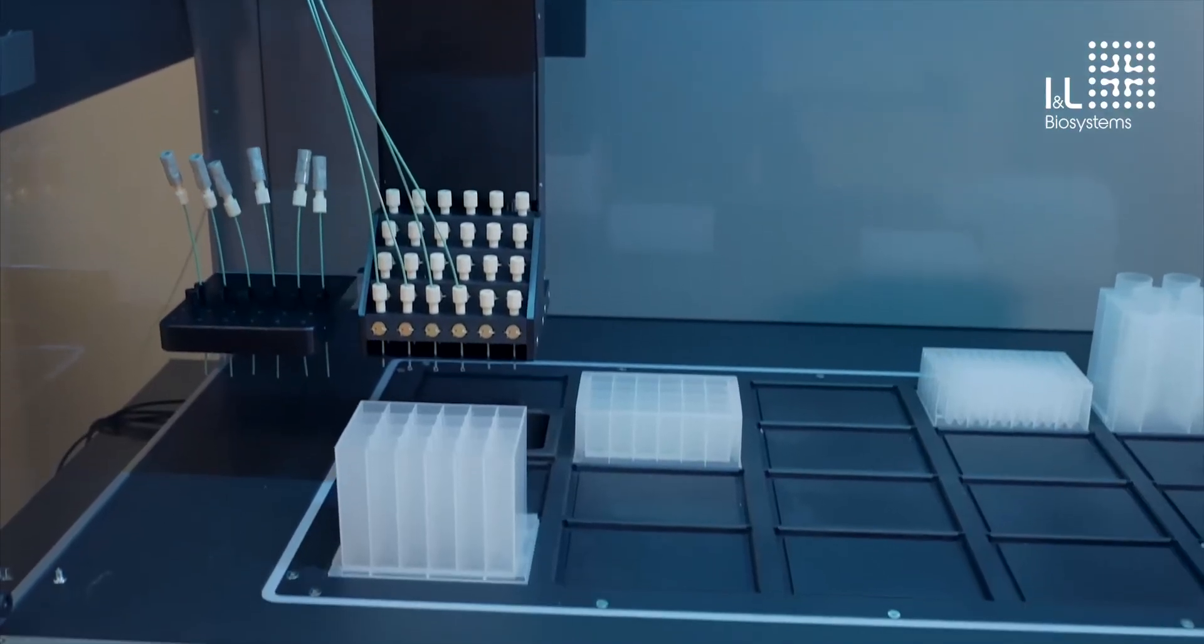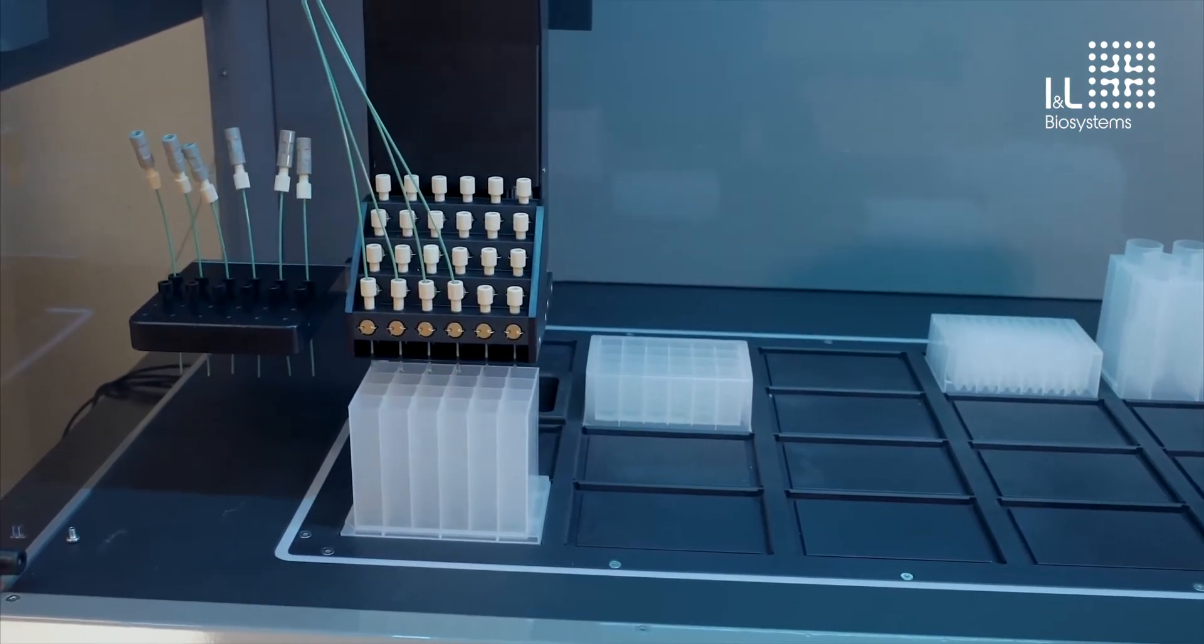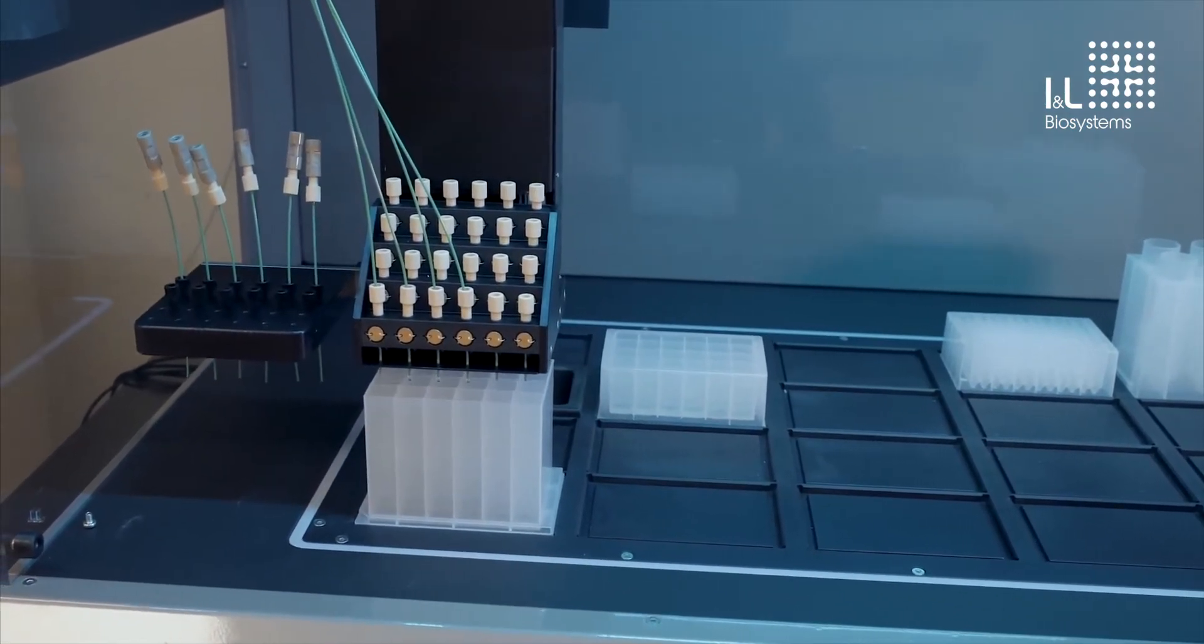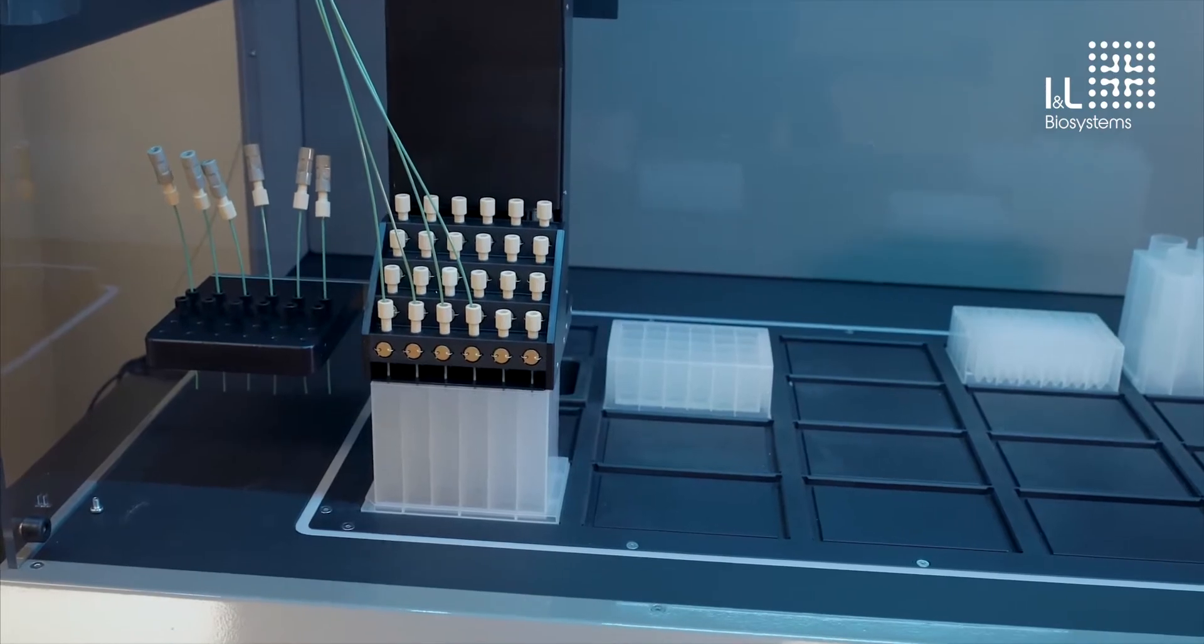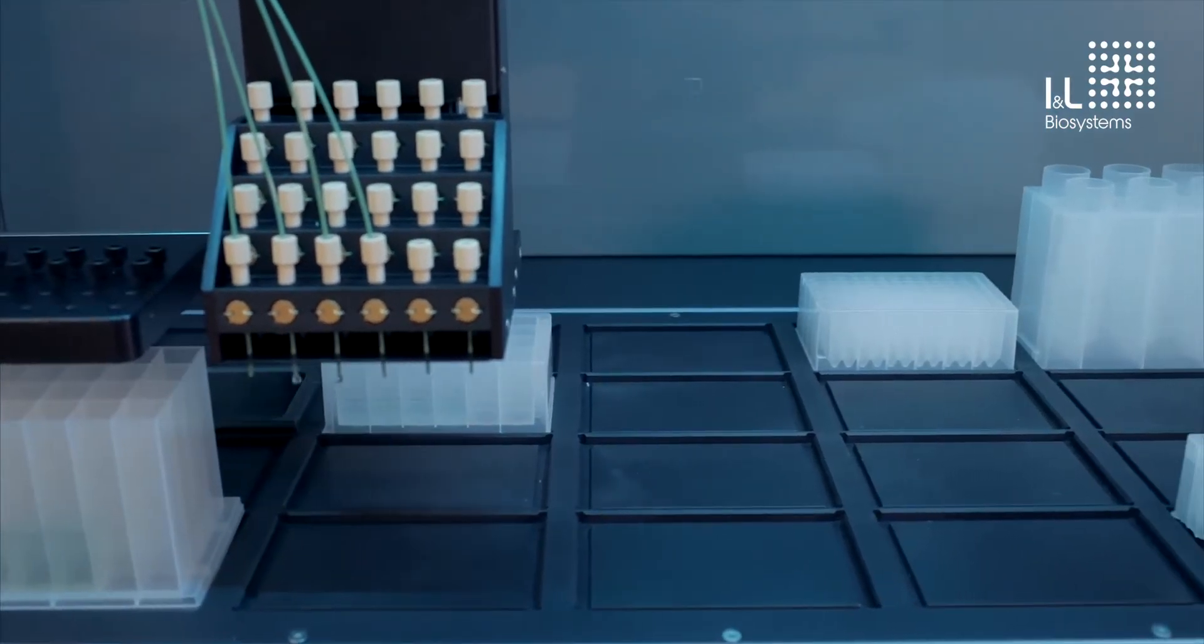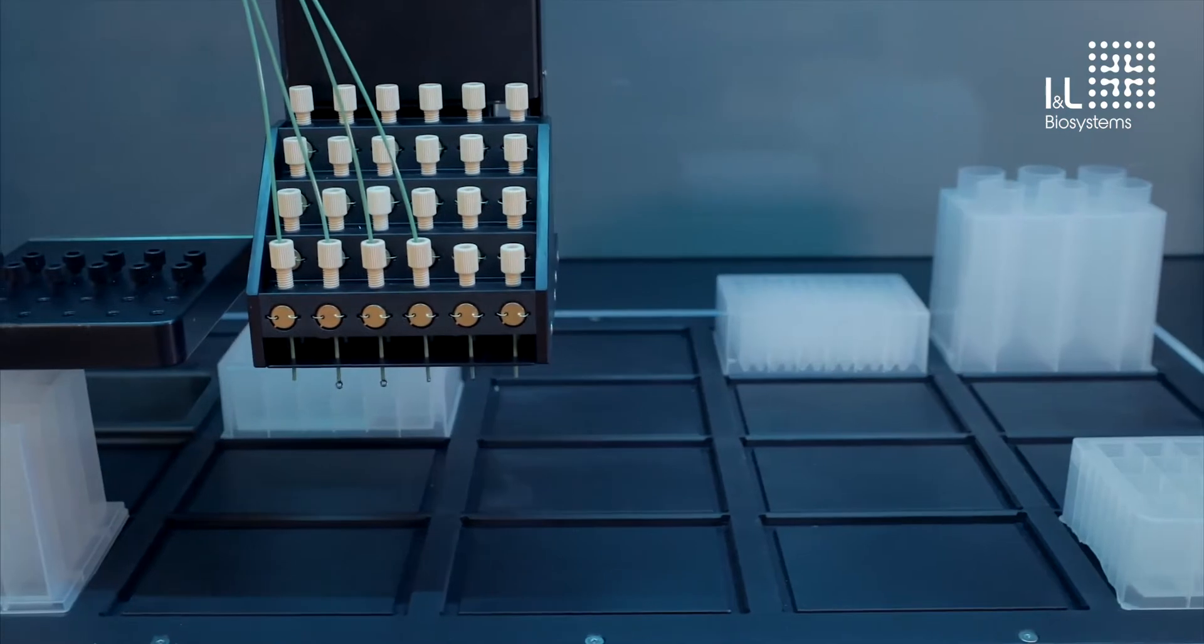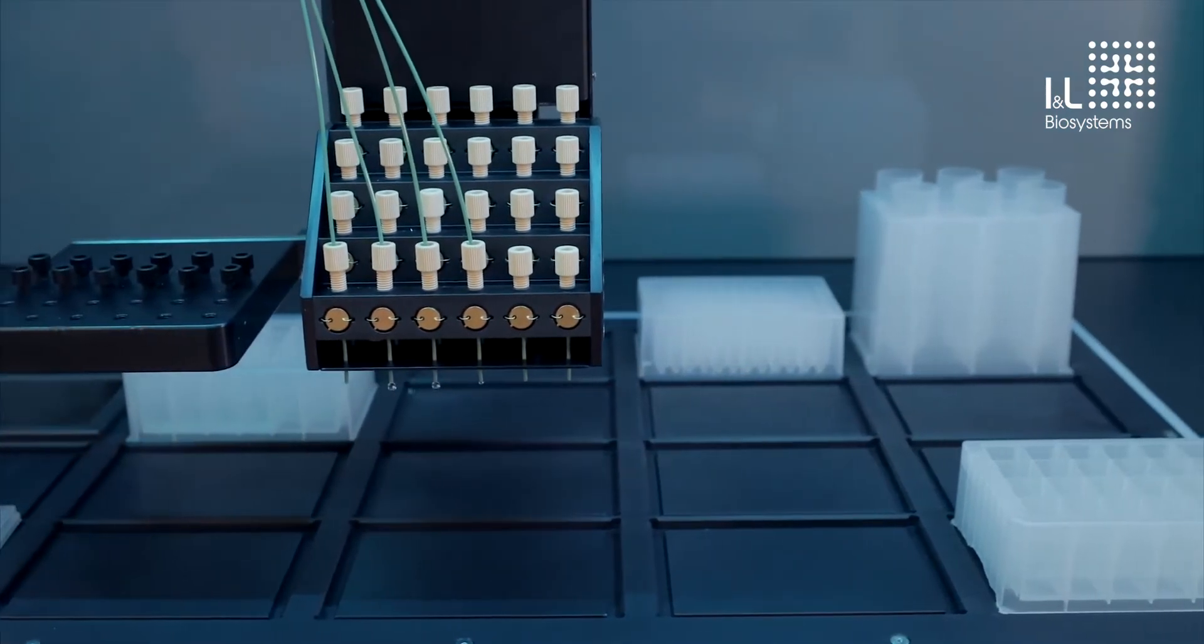In addition to the 24 pumps, there is a robotic arm that moves in X, Y, and Z axes, navigating around the fraction collection deck. The fraction collection deck contains 19 positions for collection plates of various types and sizes, as seen here.